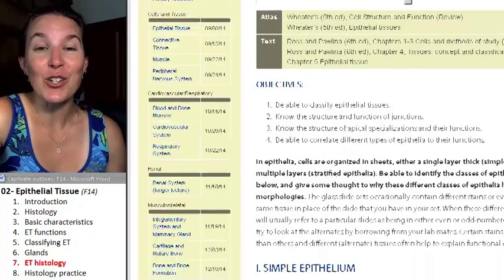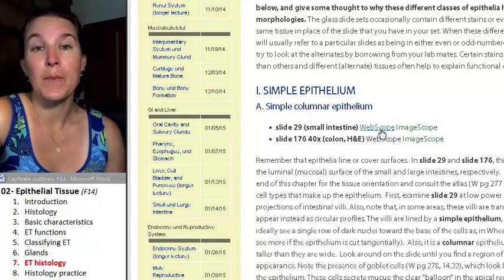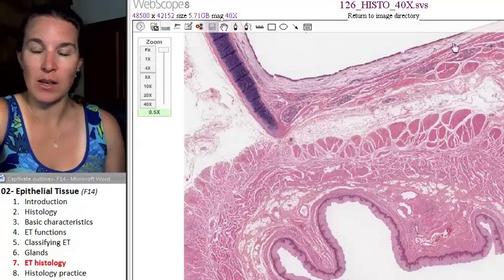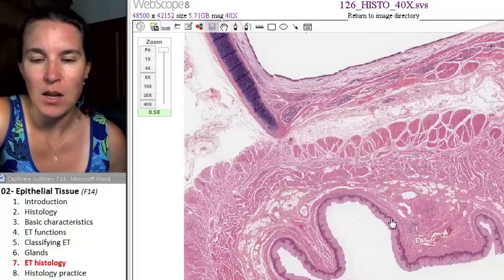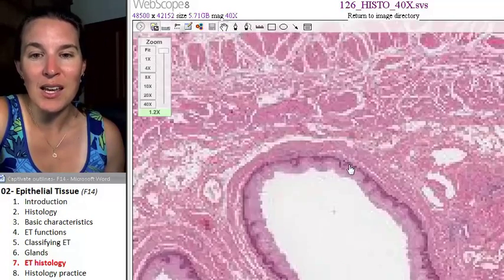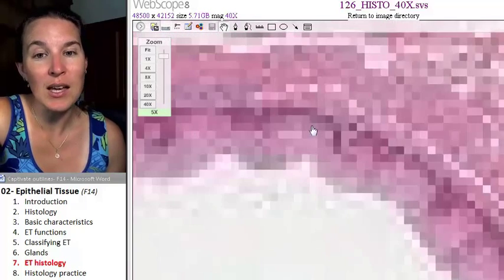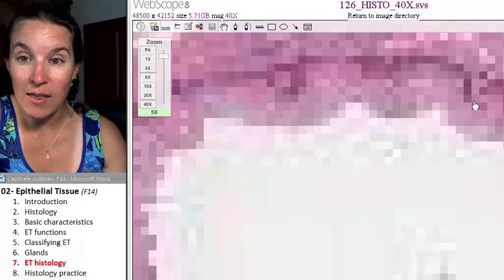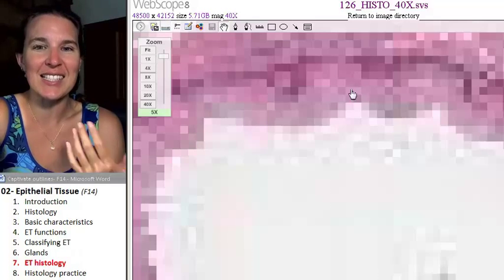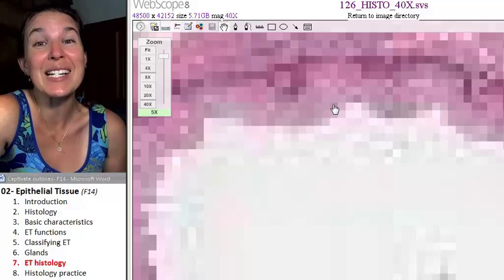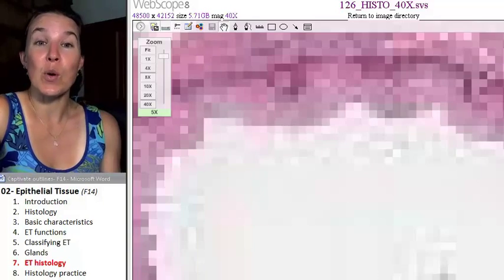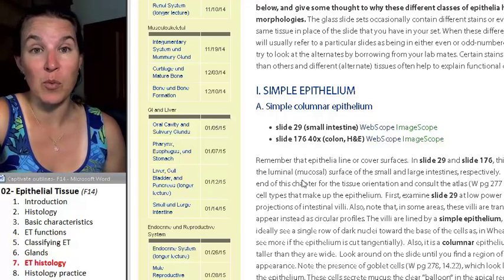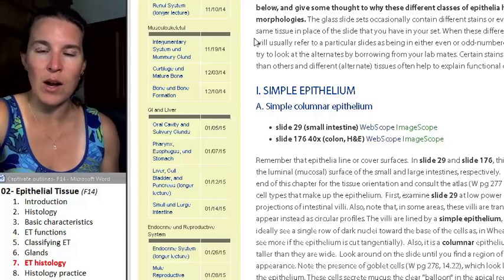They have these magical webscopes. When you click on one of these — like if I click on the esophagus — it zooms in. I'm at a place with really slow internet, so normally this would focus in instantaneously, and you can see what kind of epithelium is there. It's really, really amazing. Using these resources is an excellent way to prep for lab and to practice looking for epithelial tissues.